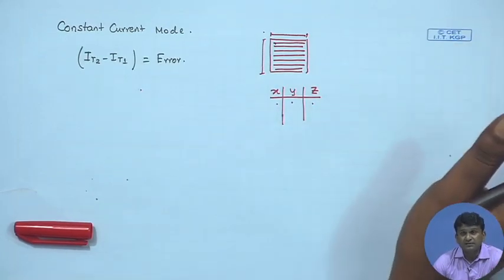So, once you have this data, all you need to do is simply normalize this data with respect to the minimum and maximum elevations, and you just put it on a grayscale, you get an image that reflects the idea about the topography of the surface. So, again this is something that I will pick up in a bit more detail later. So, this is how it works.